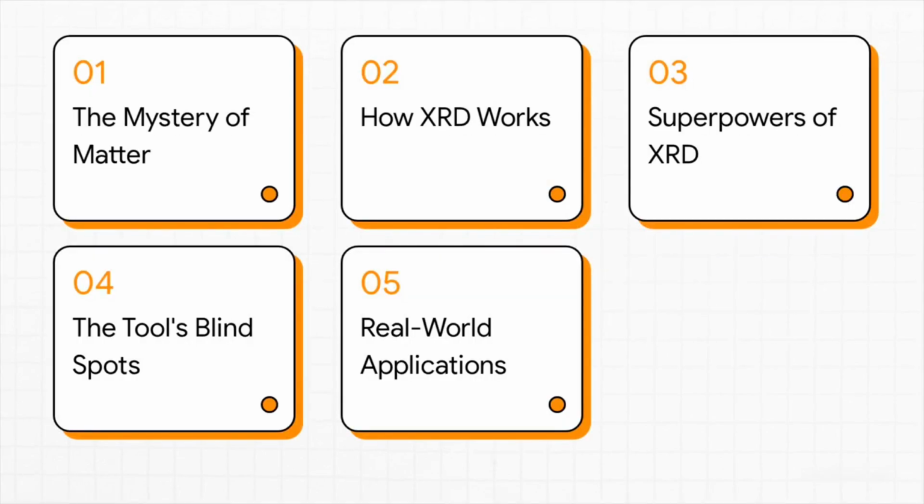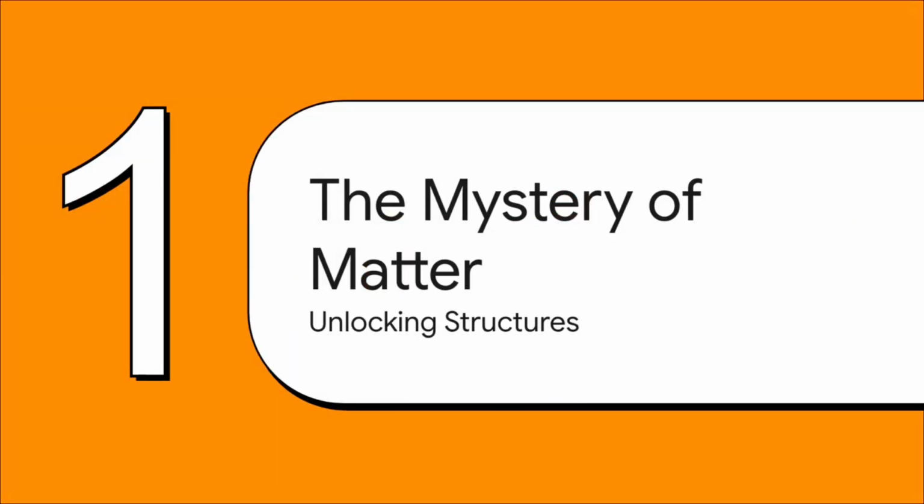Here is our roadmap for today's explainer. We'll start with the mystery of matter, then move right into how XRD actually works, look at the superpowers of XRD, cover the tool's blind spots, and finally, wrap up with real-world applications. Section 1. The mystery of matter.